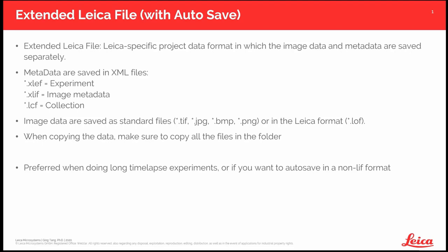Even if you choose autosave, at the end of the experiment, you still have a choice to save this project as a LIF file, so that you have another copy with all the images in one file. It's just up to you to do it or not.